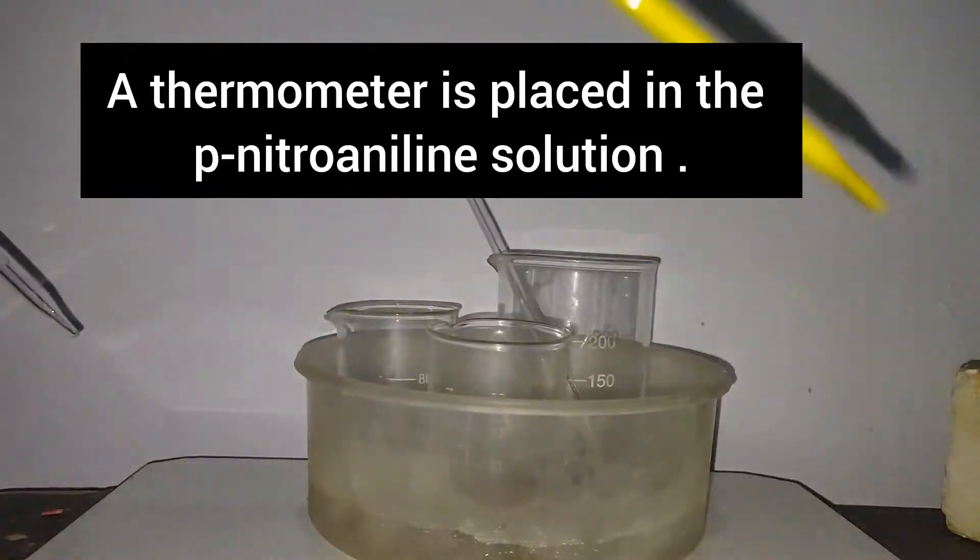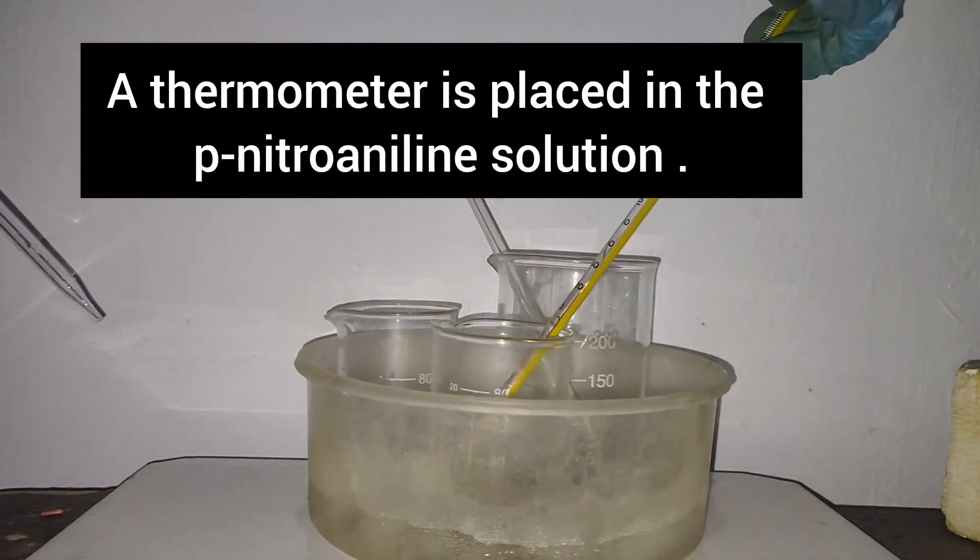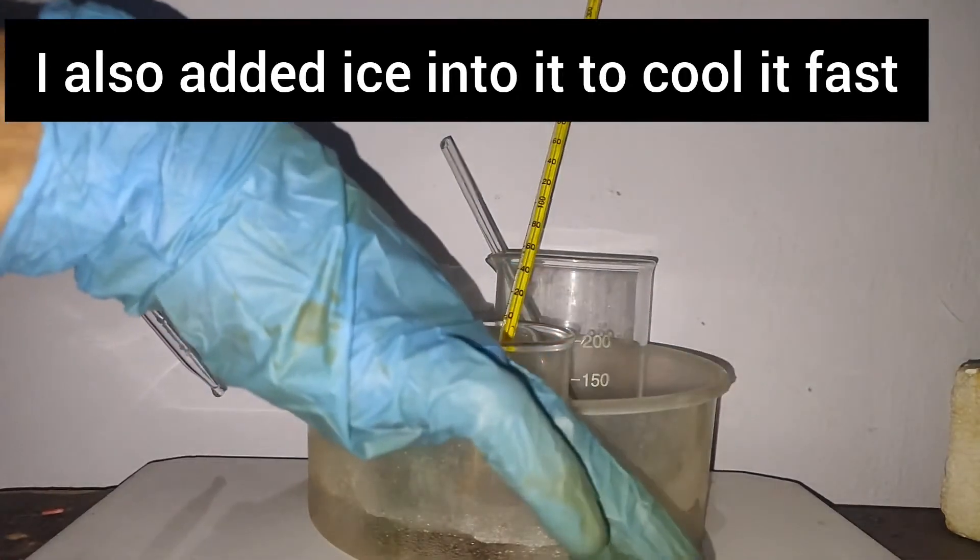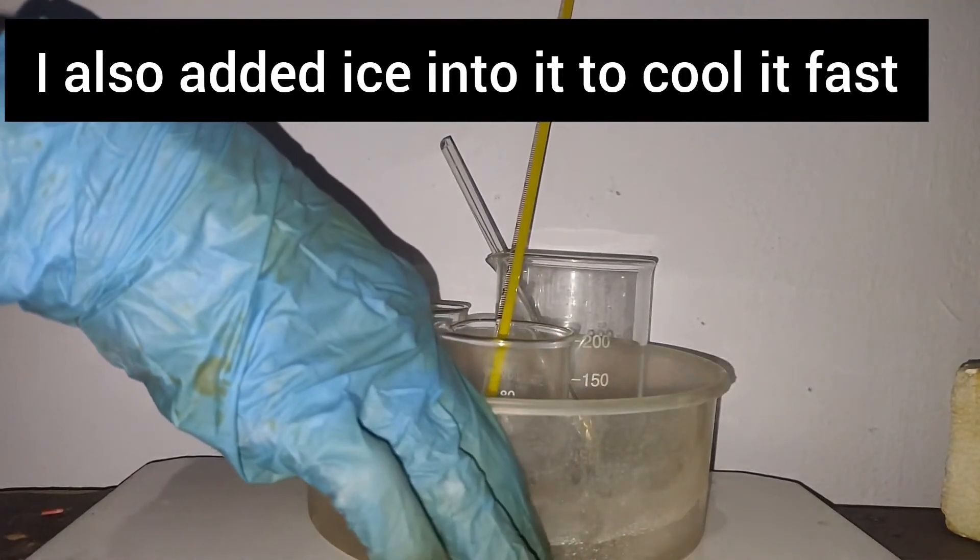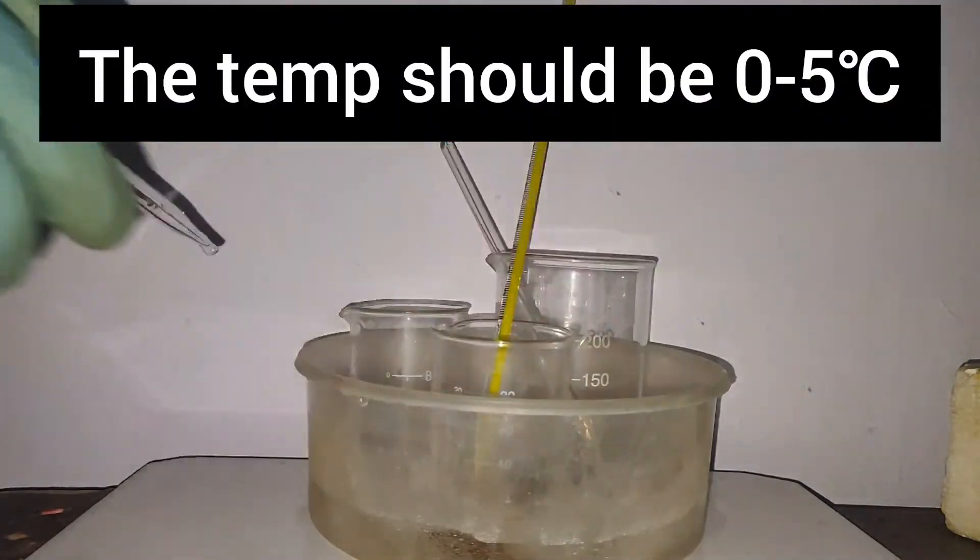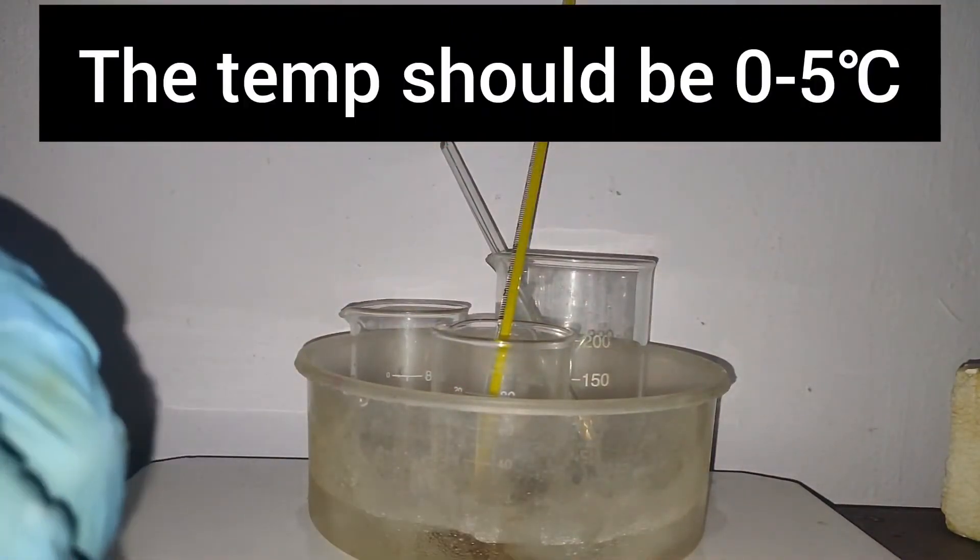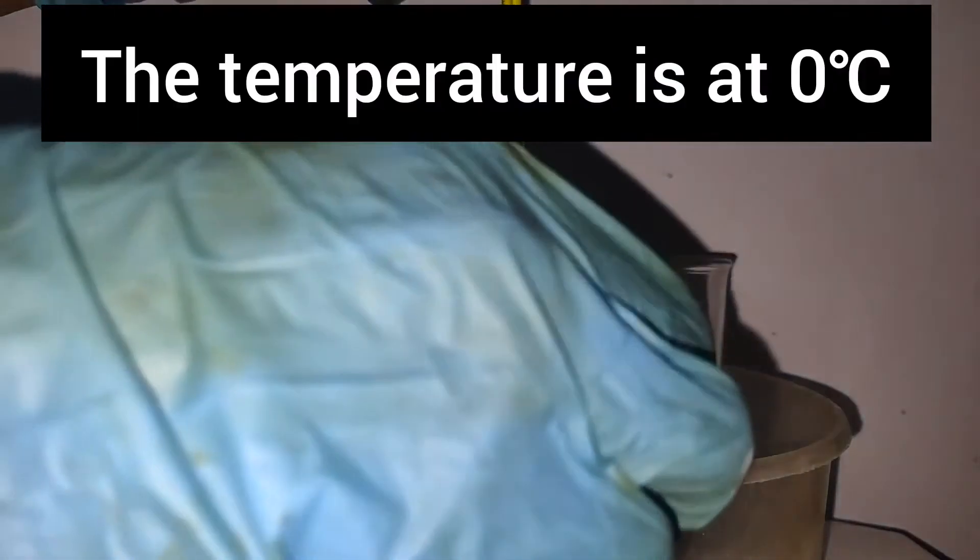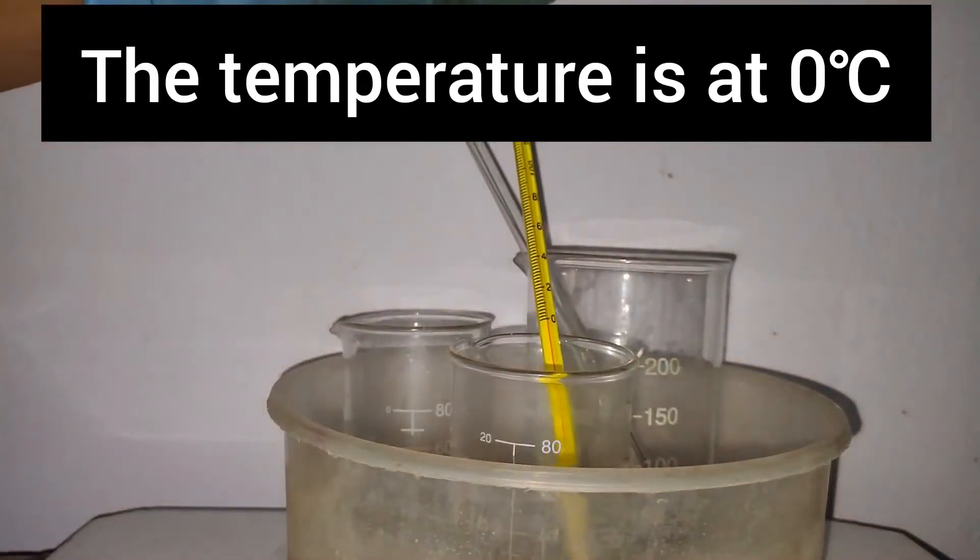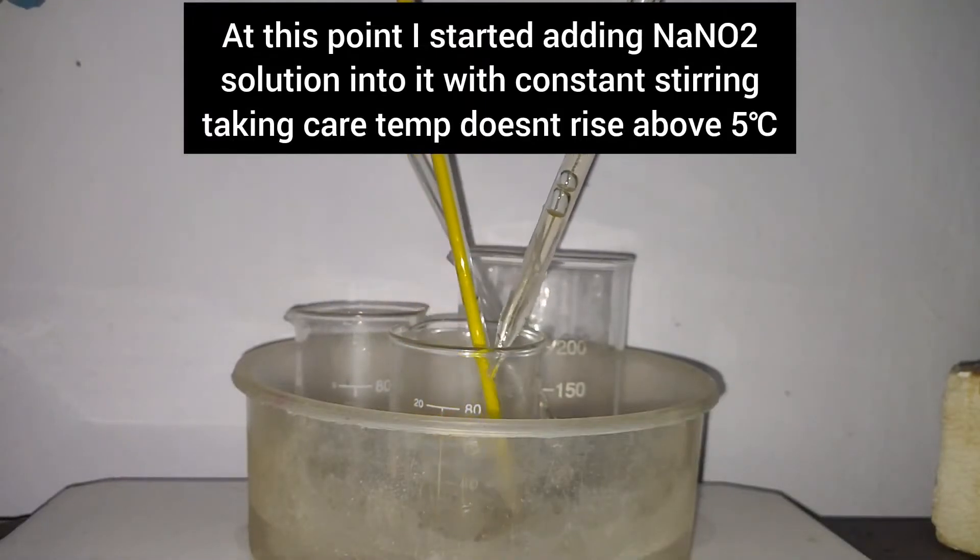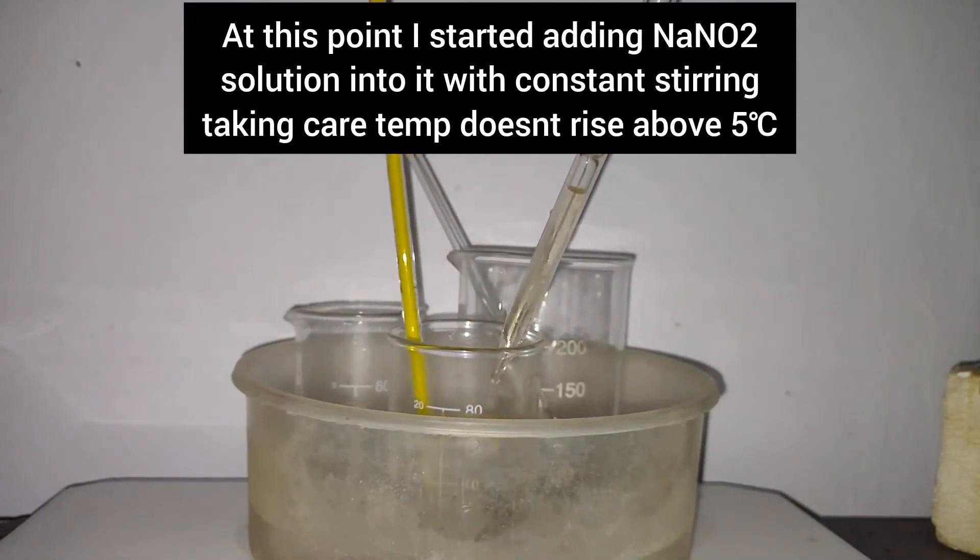A thermometer was placed in the para-nitroaniline solution to monitor its temperature. The temperature was not falling to 0 degrees Celsius, so an ice cube was added inside the beaker. The temperature quickly came down to 0 degrees Celsius. At this point, sodium nitrite solution was added with constant stirring, taking care that temperature does not rise above 5 degrees Celsius.